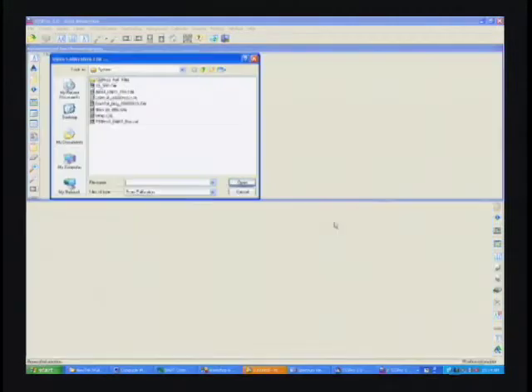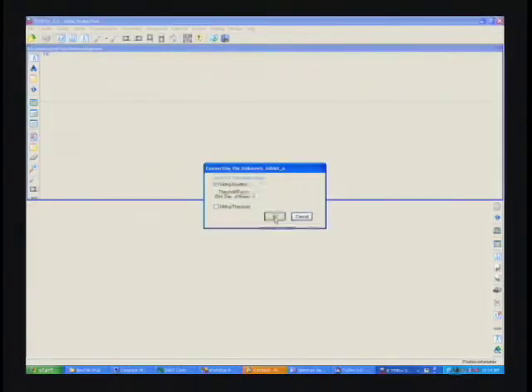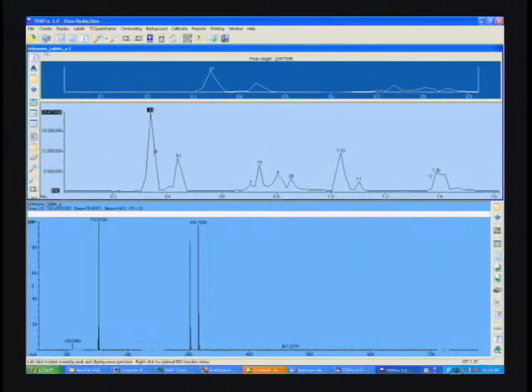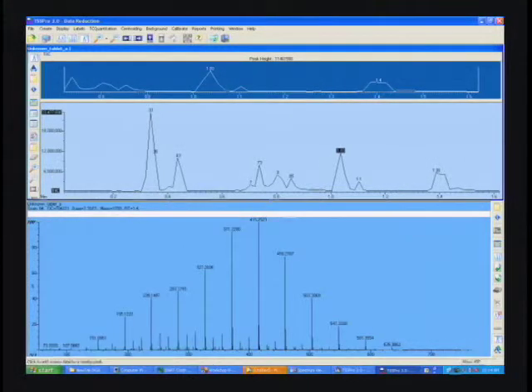Click the Open button, give it an initial calibration to import the data. Just accept the defaults. And now the program has actually found the reference compound, locked in on it, calibrated the file, and now all of the masses will be exact. That probably went by very fast, but in short, what it did was find this polyethylene glycol spectrum.